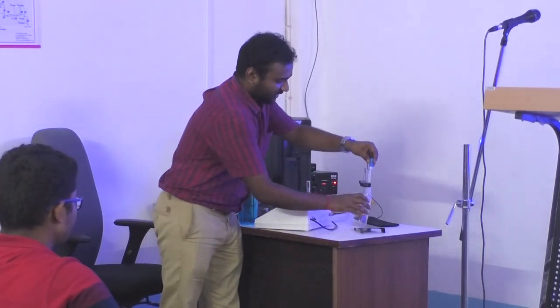This is the experiment. We have to take two standard solutions, one is acidic buffer and one is neutral buffer. First we have to take the acidic buffer and this glass electrode and dip it in this one. Then we put the functional knob in the pH and first we make the temperature constant at room temperature. Then we adjust this in the slope and after the slope the pH, and then we have to calibrate it. And we will get the result over here, which is pH 4.